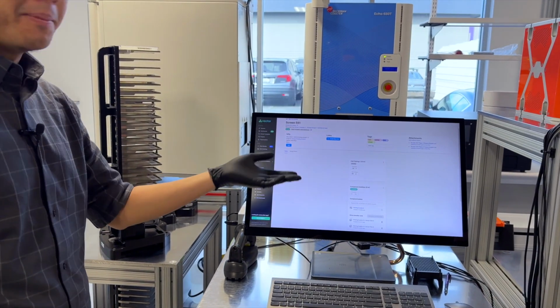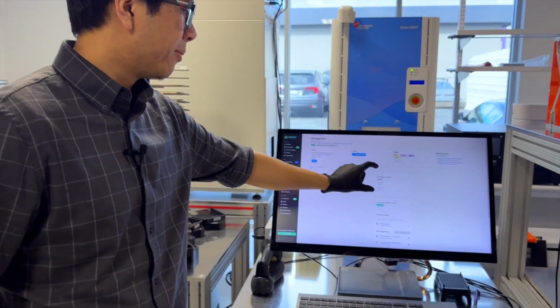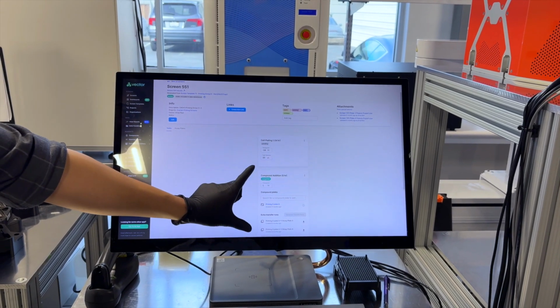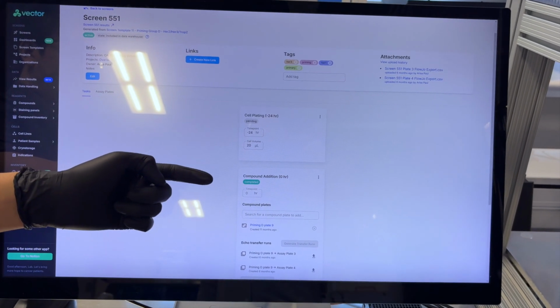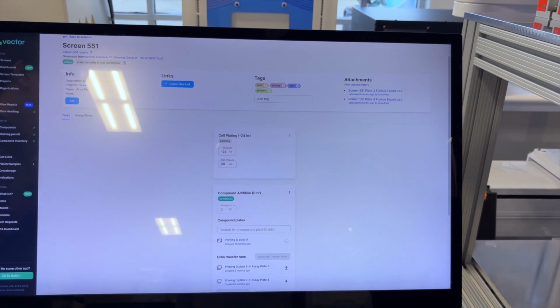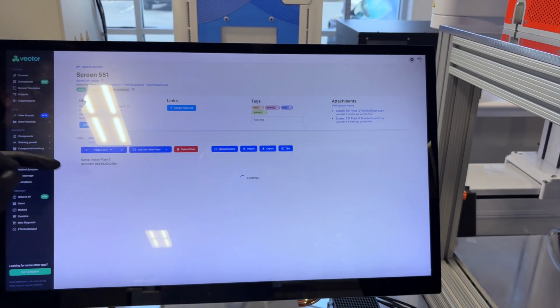But we've talked a bit about modularity. This is an example of one of the screens that we run. You kind of see these little blocks that allow scientists to put together their tasks. I'm going to plate cells, and I'm going to drug these cells on day 0. And then if I click on these plates, I'll be able to see what drugs we've had and where each compound is going to go. So this one's a pretty simple 2-plate screen.